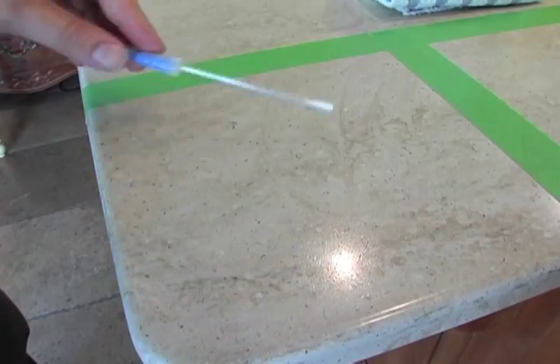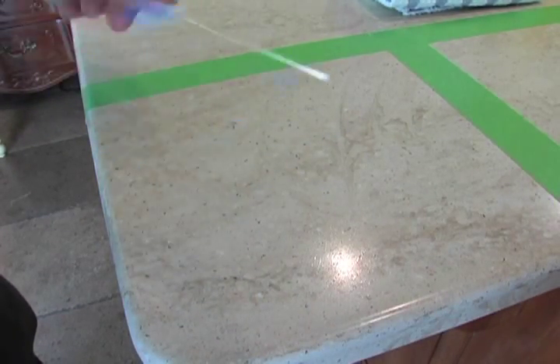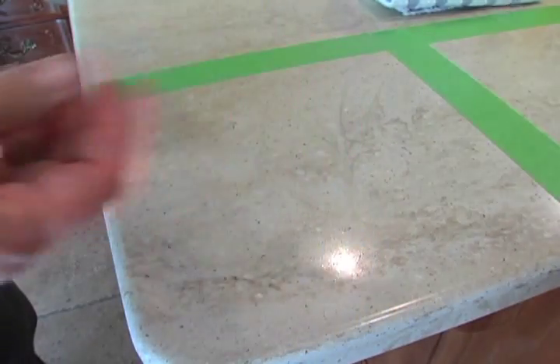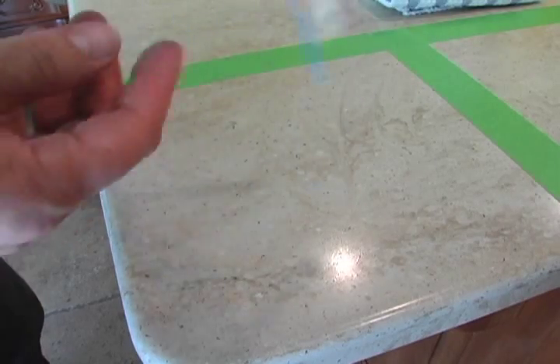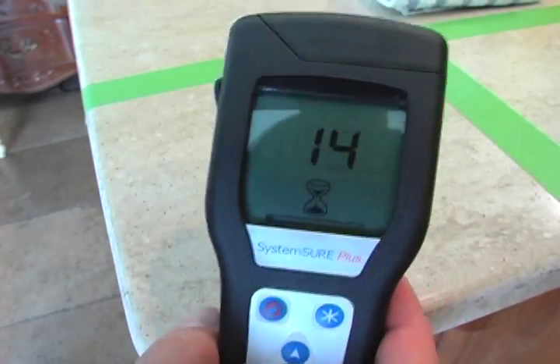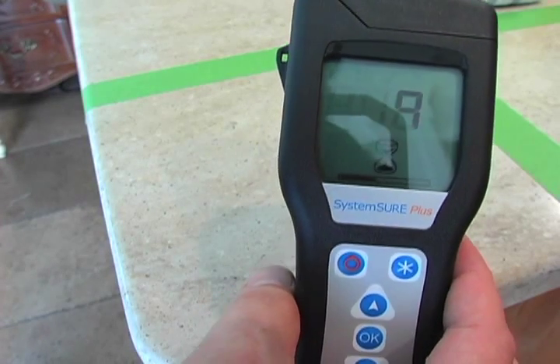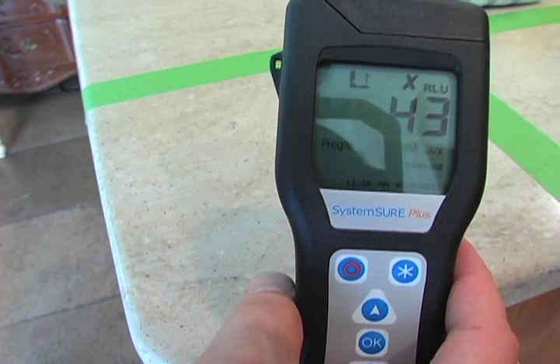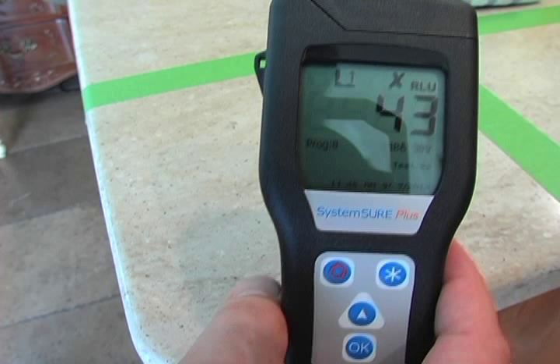Then I take another swab, swab the area thoroughly, place it back into the tube, break the tip, squeeze the solution in, shake the swab up, place it into the ATP tester, hit OK, and let's see the result after using the cotton cloth. The cloth gave us a reading of 43, which is actually pretty good. According to the manufacturer, anything over 30 is a fail and anything under 10 is a pass — keep that in mind as we proceed.